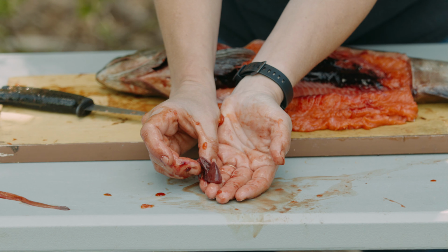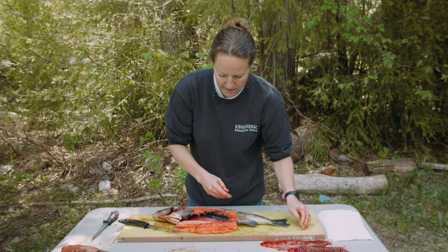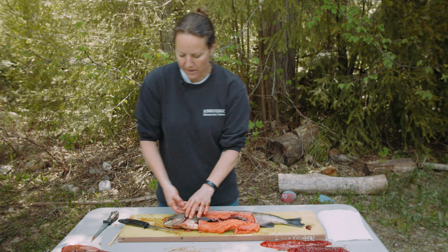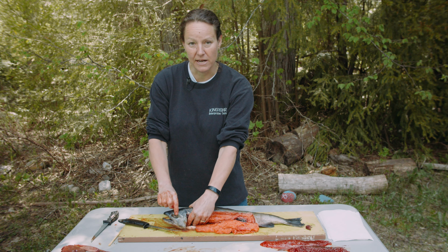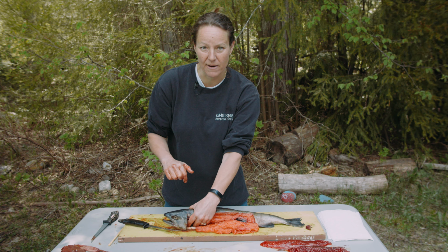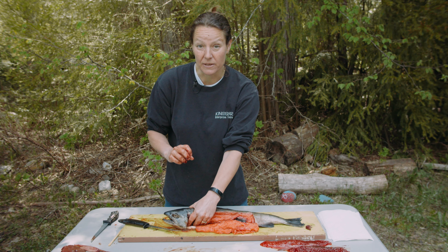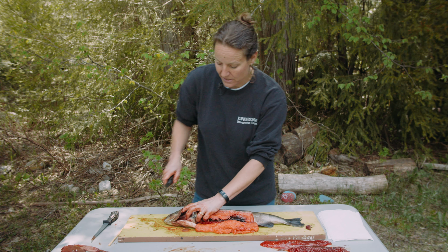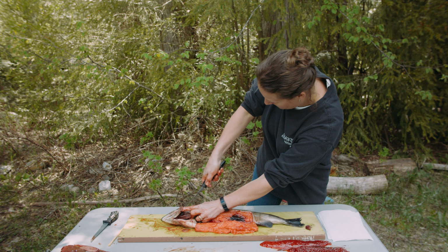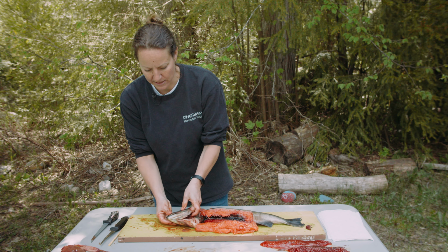Okay, excellent. Now, boys and girls, if you are interested, I would sure like to show you the eyeball of the fish. So in our last video, we talked about how the eyes are on the side of the fish's head, so the fish can see almost all the way around itself. Well, today, we're going to take that eyeball out and have a closer look. So I'm going to give it a little slice back in here. Okay, and see if that worked.